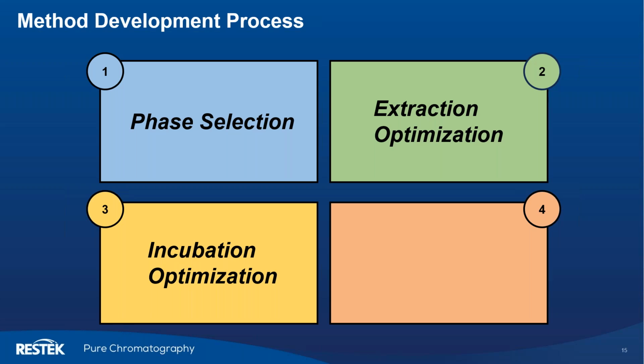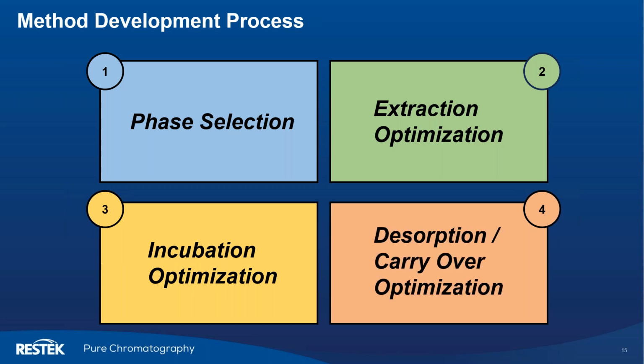So how long does it take for our analytes to move to the headspace, or partition into the headspace of our vial? And then finally, evaluating desorption and carryover for optimal conditions. So as you can see, in the way these parameters actually take place through a SPME method, incubation takes place prior to extraction.